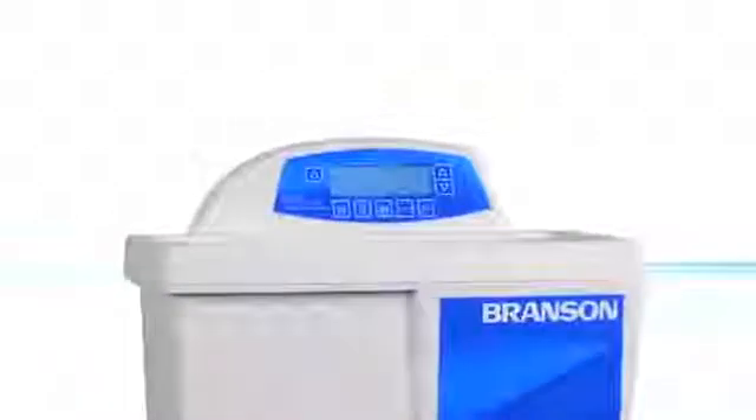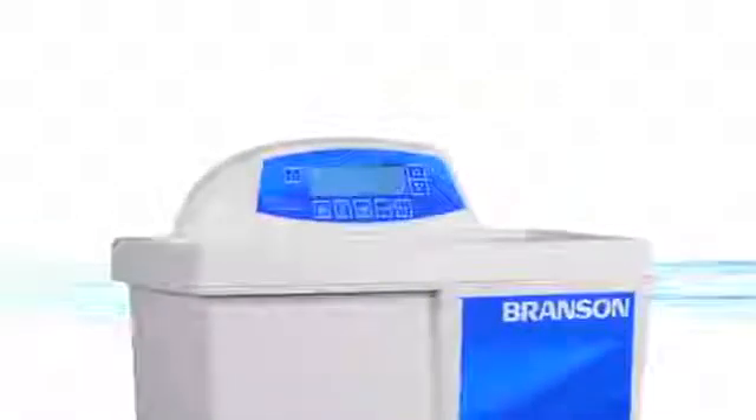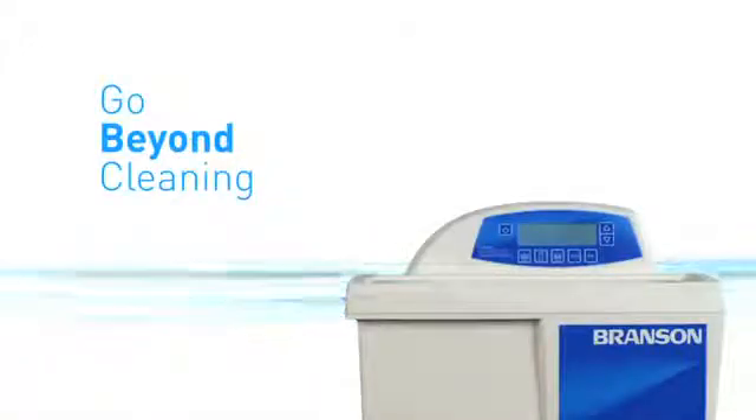From our innovative self-adaptive technology, to flexible programming, to a variety of sizes to accommodate a host of applications, we've reimagined what it means to clean with precision. Are you ready to go beyond cleaning?